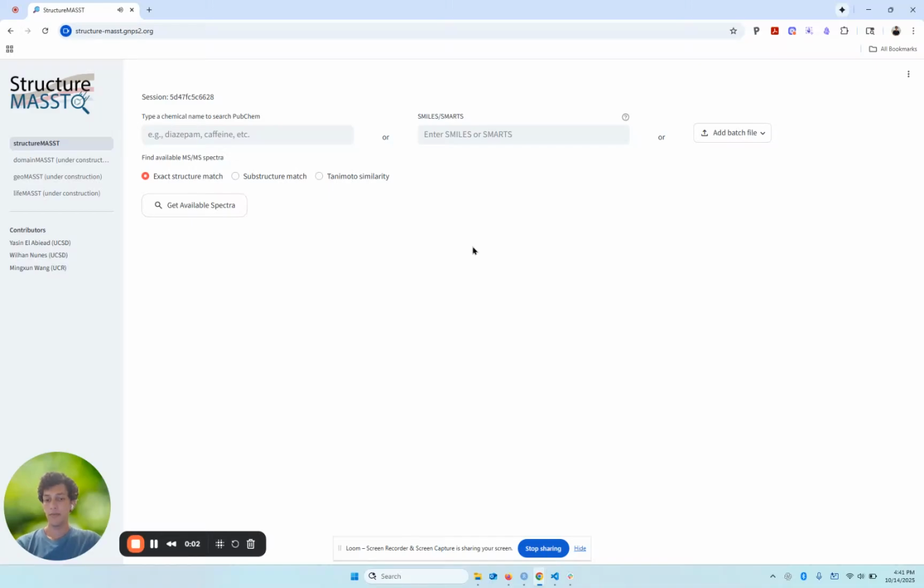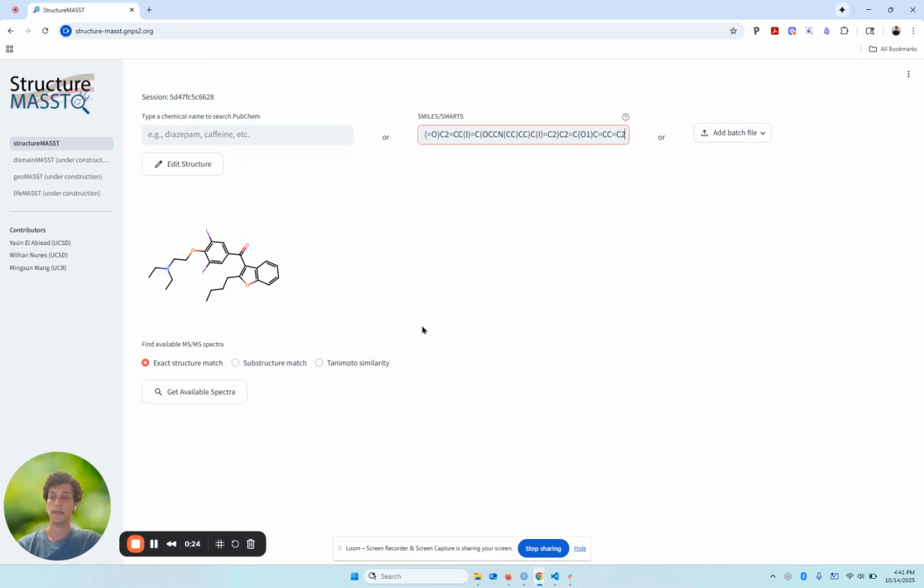Okay, hello and welcome to this quick walkthrough of StructureMASST. If you're watching this video, I'm assuming that you have already watched our video on exact structure searches, because here we will only be talking about modification or analog searches. For this, we will look at an example that we have already looked at in our manuscript, particularly for this drug molecule here.